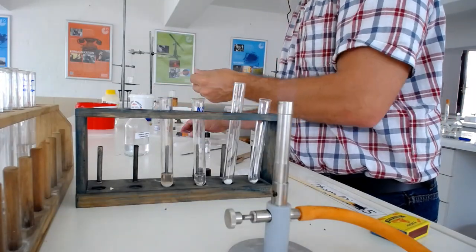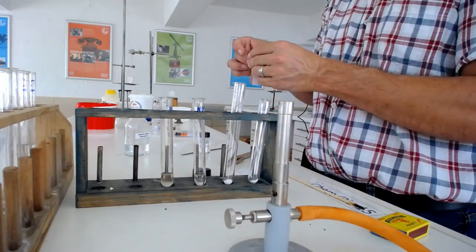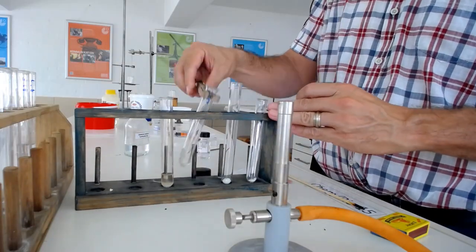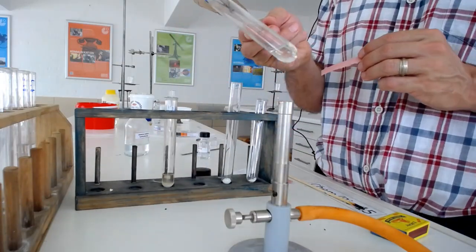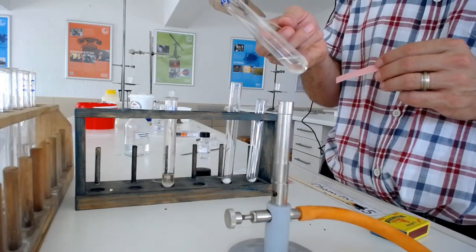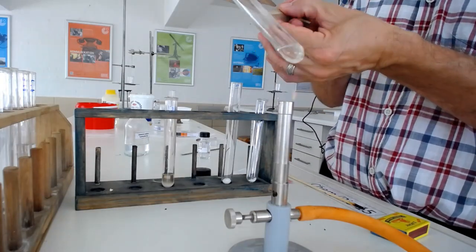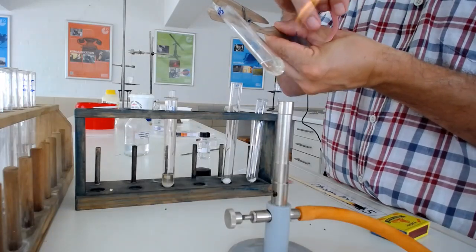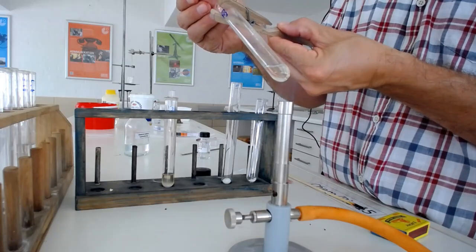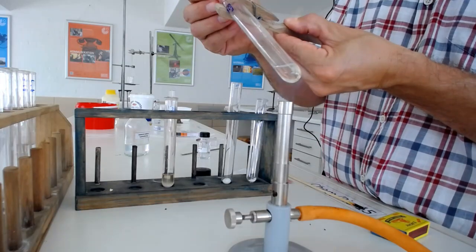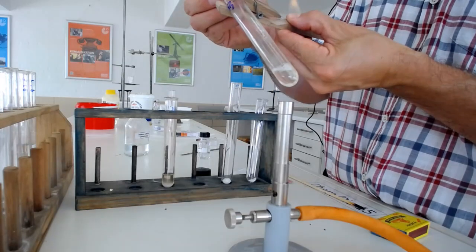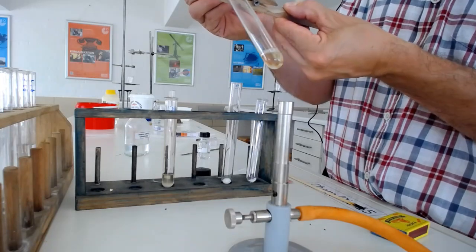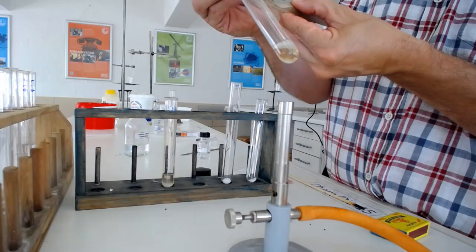So again, red litmus paper turning blue because ammonia is a basic gas. This is really important that you know that. And remember, always when heating, it's at an angle. You don't want to aim it at someone. Look at the moisture there, so there's some water vapor coming off. Let's heat it some more.